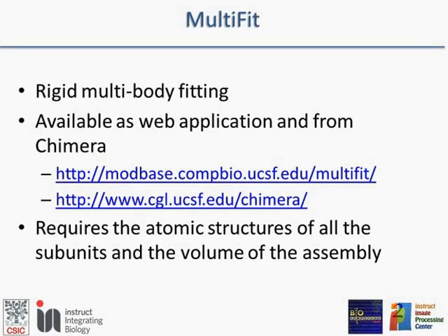It's also available as a web application, so if you don't want to use Chimera, you can go to this web page and it's almost the same. What you need to run this program is the atomic structure of all the subunits and the three-dimensional volume of your complex.